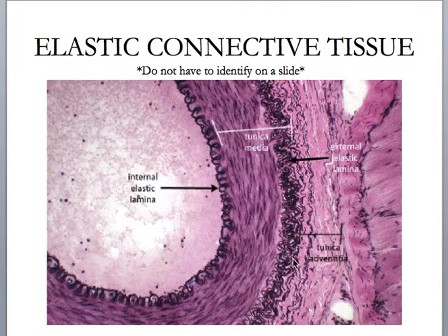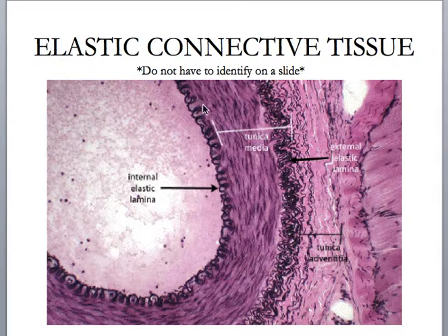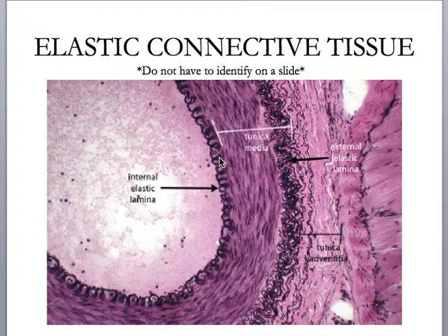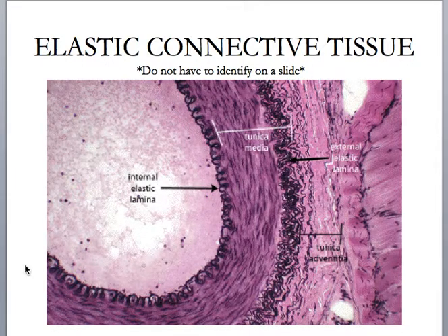Over here, all of this is also elastic tissue. So you don't have to identify this on a slide. I just want to make you aware that you can find elastic connective tissue or elastic fibers as part of other organs. Large arteries have to withstand lots of pressure from the blood that's pulsing through them. They have to be able to expand when blood is present and then recoil to their original size so they can propel blood forward. This is connective tissue embedded within a separate organ.